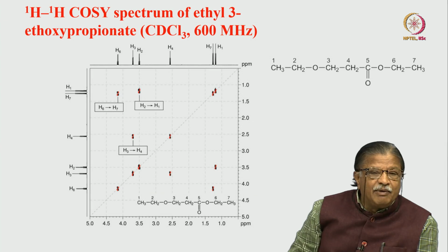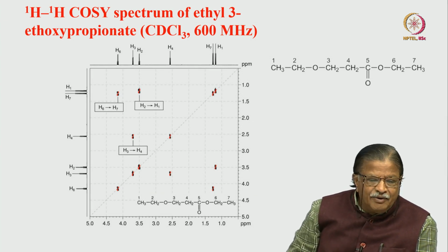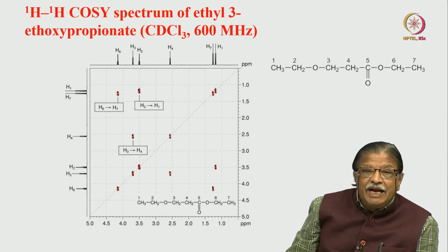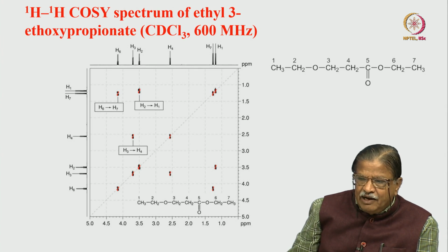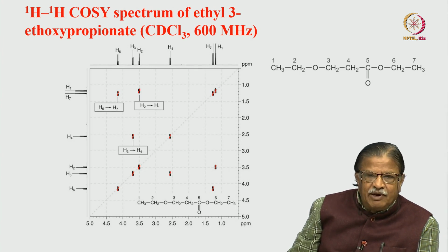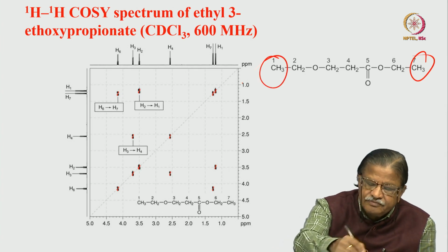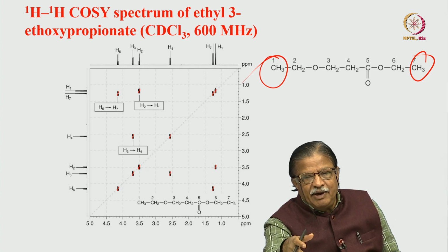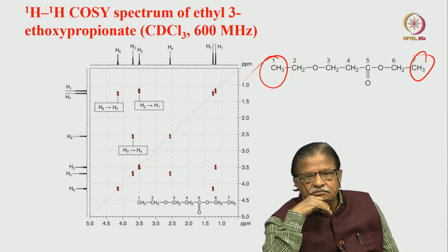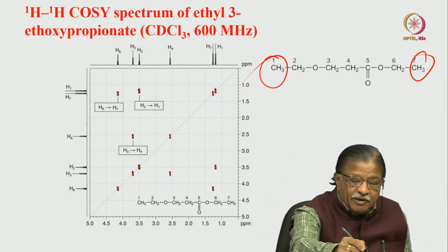We will go to another bigger molecule, a little lengthier. Now we will make the assignment. Where do we start with? As always, look at the molecule carefully. Both these molecules will have terminal groups which are CH3, and each of the CH3 is coupled, the next immediate neighbor is CH2. Obviously, these two peaks have to be triplets. There are two triplets here.